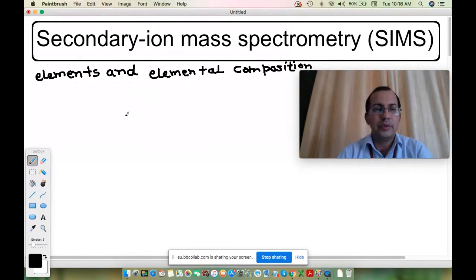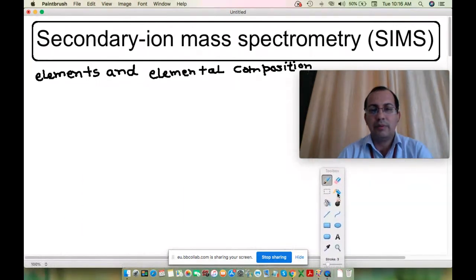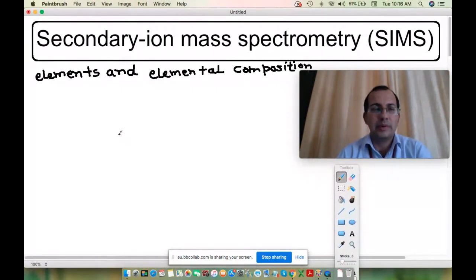If you recall, we have to see the different instruments involved in this case one by one.